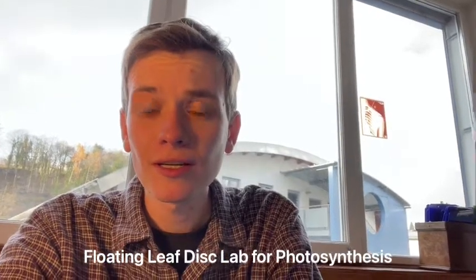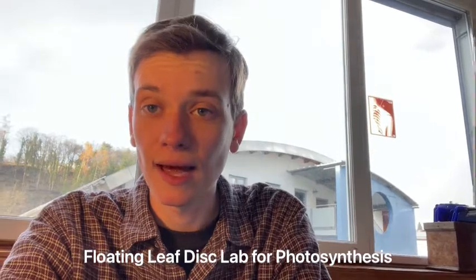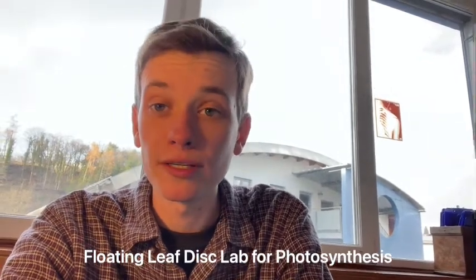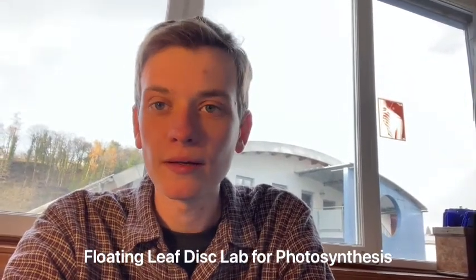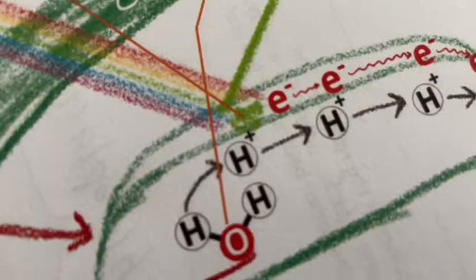All right, so this is how to set up the floating leaf disc lab for photosynthesis. I do this lab in the energy unit. So after we talk about food webs, we get into photosynthesis.